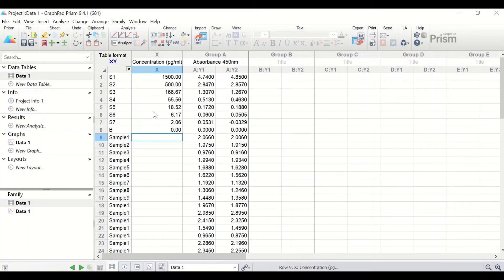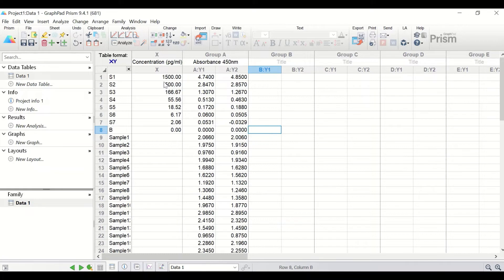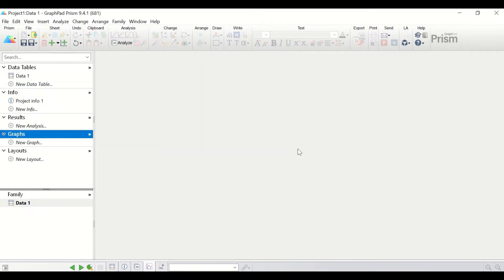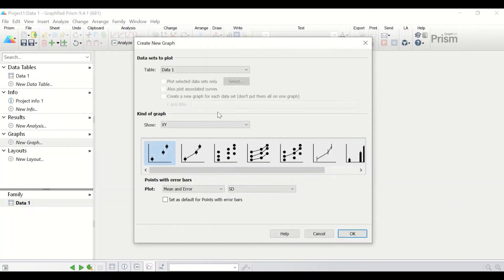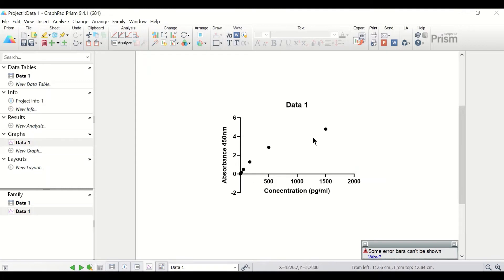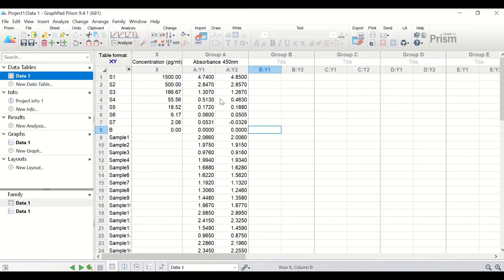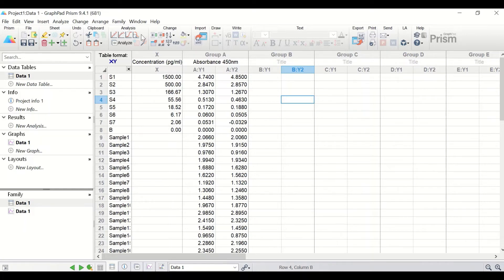To proceed with the analysis, we first have to construct a standard curve based on the absorbance and the concentration of the standard samples from the serial dilution. First, generate a scatter plot for the standard samples by clicking on the graph and selecting New Graph, then choosing the scatter plot and clicking OK. The scatter plot shows that the standard curve is not linear. Go back to the data to generate the standard curve and calculate the concentration for the unknowns by clicking on the analyze icon.